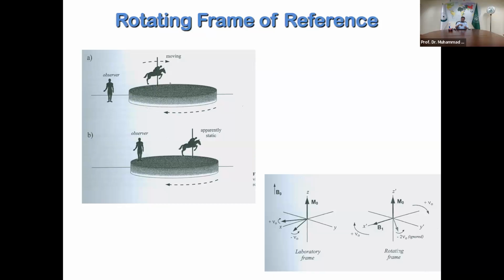So you can see them moving around. This is the concept which was introduced, and it makes life so easy because now you know exactly which proton is where. Atir, can you kindly explain this to the students now?